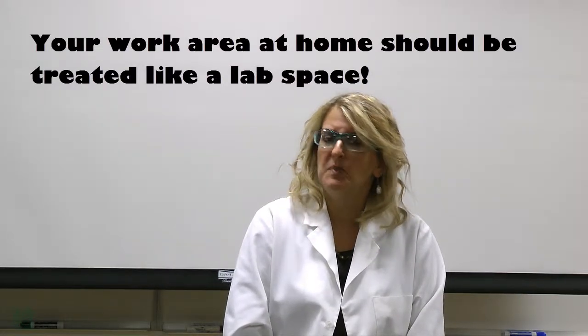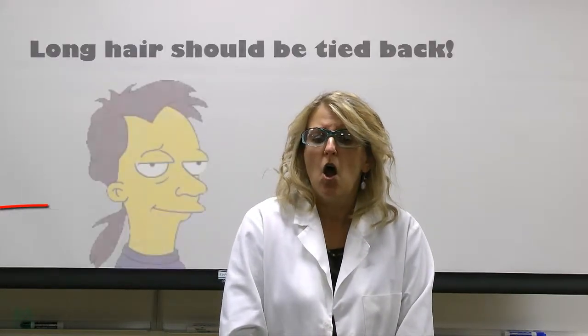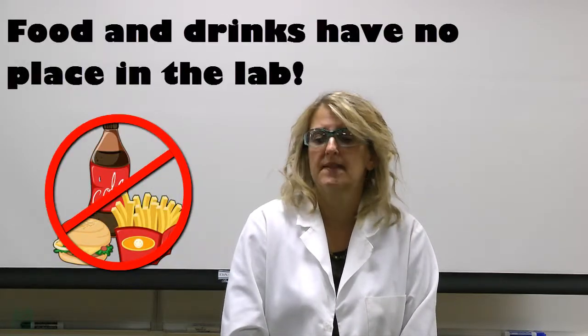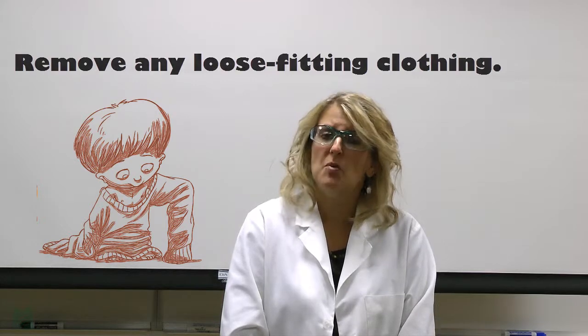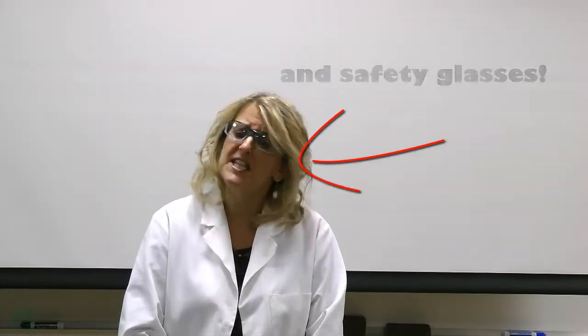Your work area at home should be considered to be a lab, and there are some general safety precautions that need to be followed. Long hair should be tied back. If you wear contact lenses, please remove them. Food and drink have no place in the lab. Remove any loose-fitting clothing. You may wish to wear a lab coat or the apron that is included in your kit. You should also wear gloves and safety glasses.